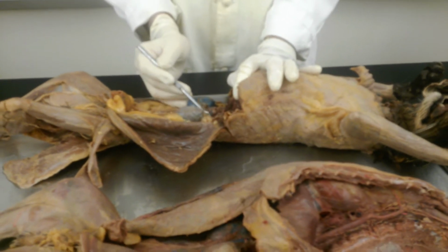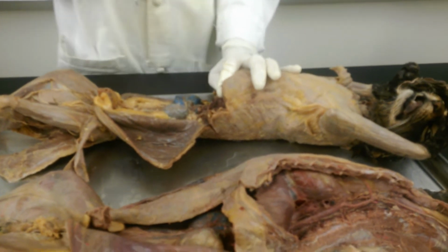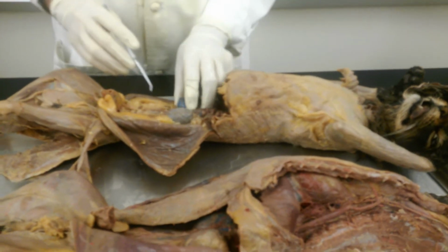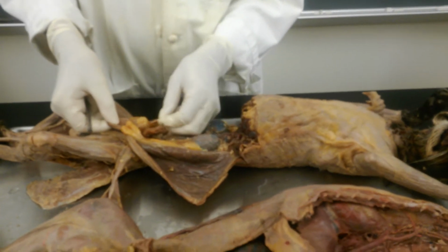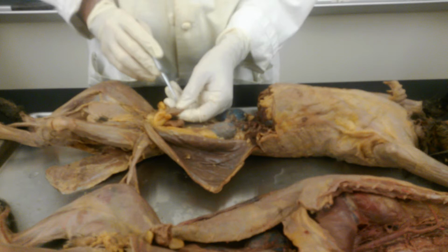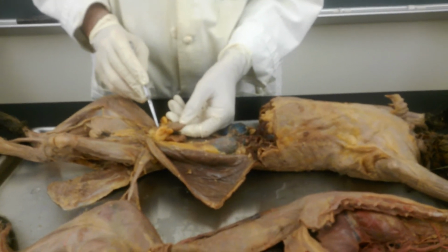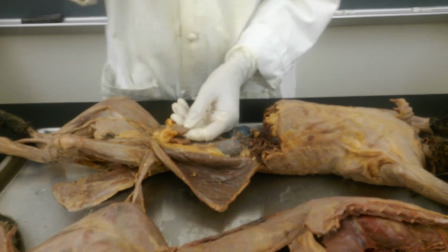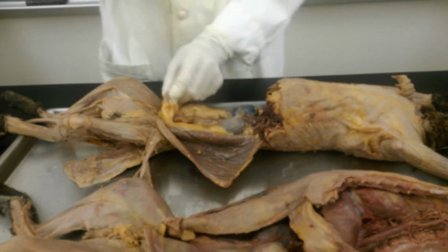And on yours, after you've seen it, slice it in half. You should be able to see the medulla and the cortex distinctly different. Anyway, if you follow the ureter down here, it joins the bladder. I haven't done it yet, but you're going to open up the bladder on its ventral surface, and you'll be able to see this. You should be able to see the ureterovesicular junction. It can be a little bit obscure, but it is there.